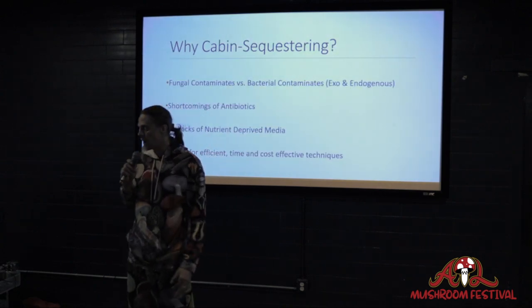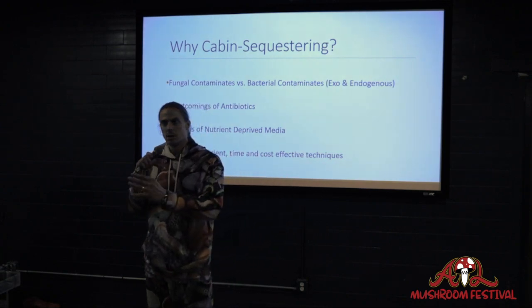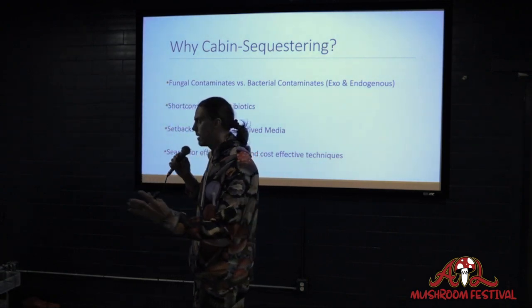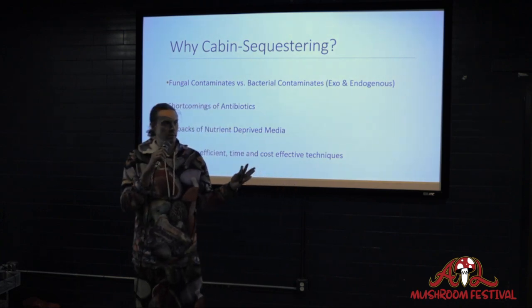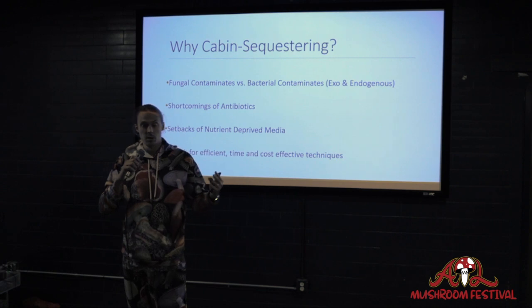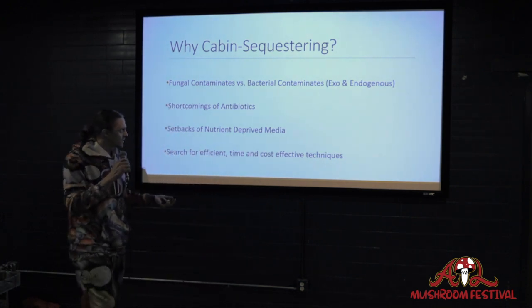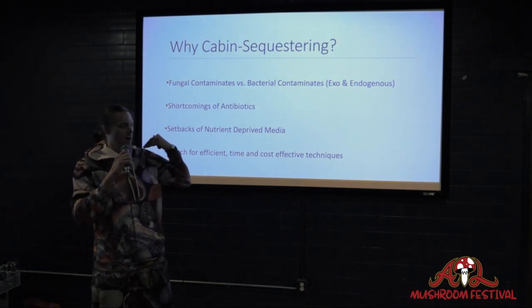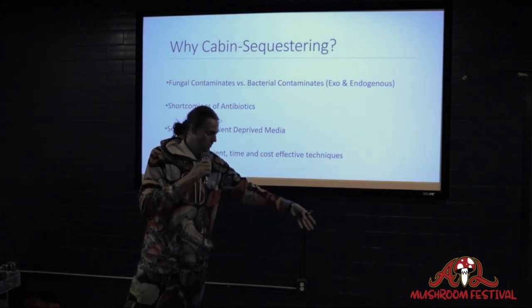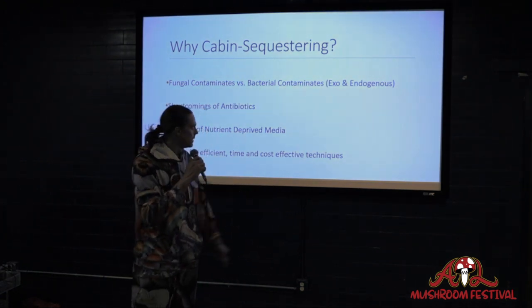Okay, so why cabin sequestering? The bane of mushroom culturing is contamination. And you have generally 2 different types of contaminants, fungal and bacterial. And then you have 2 different types of contamination sources, endogenous and exogenous. So things that are either contaminants from the environment that are coming into your culture or things that were already growing with your culture, right?